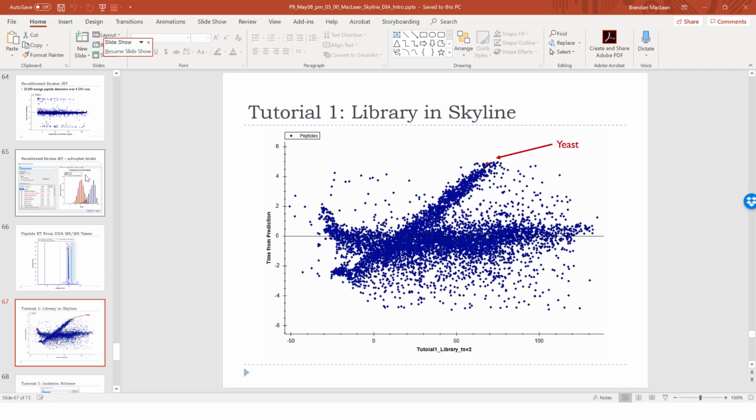So anyway, this was actually the library generated at one of the DIA courses using SpectraST. And it came out like this. The problem is that Skyline makes this really easy to look at and really obvious, but with certainly other tools, it's like, well, everything's within 5 minutes.